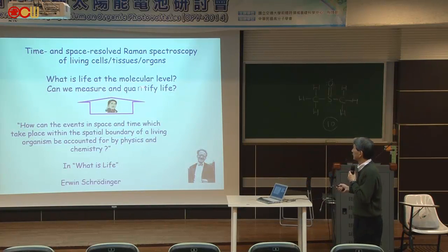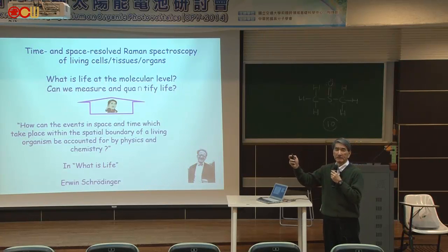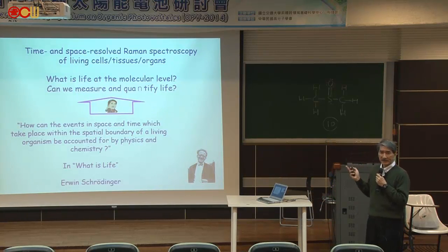So then, can we measure and quantify life? It's a very big question. You say that this cell is living, but this cell is dead. Can you make a distinction between a living cell and a dead cell by Raman spectroscopy? And we challenged that kind of thing.